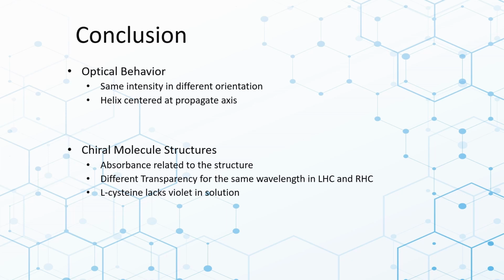Such sources of error are the possibility of not having a high enough concentrated solution. Potentially, part of the light is absorbed by dust in the monochromator or the connection with the CCD camera that occurred after calibration, and just normal noise interference from our environment. We would also be able to have a better understanding if we used D-cysteine and compared those plots with L-cysteine. Still, the study can provide a data reference for other scholars entering this field of CD spectroscopy.